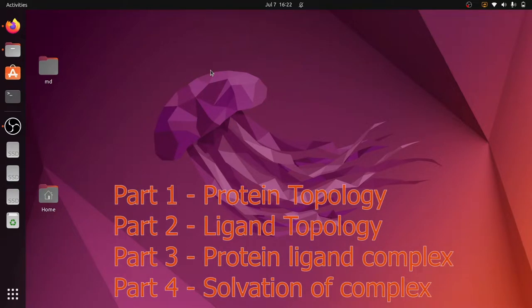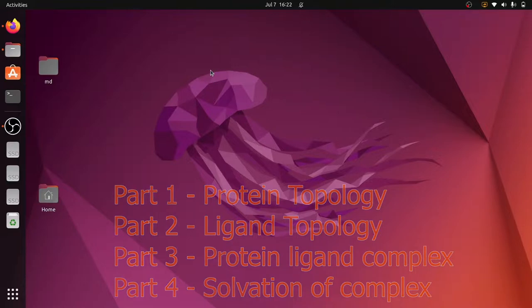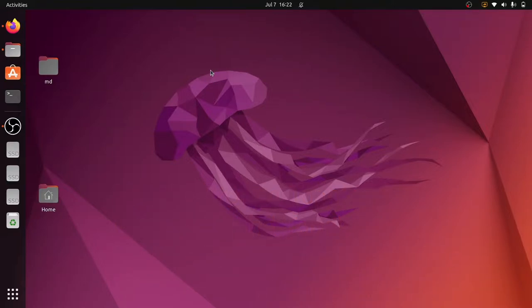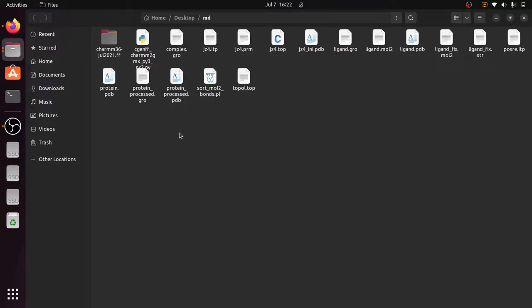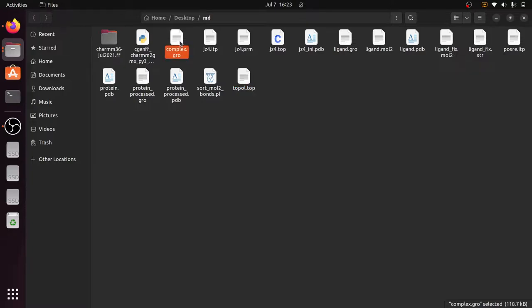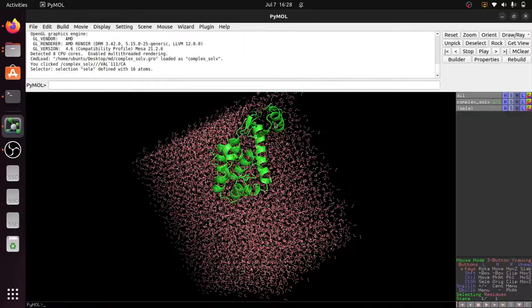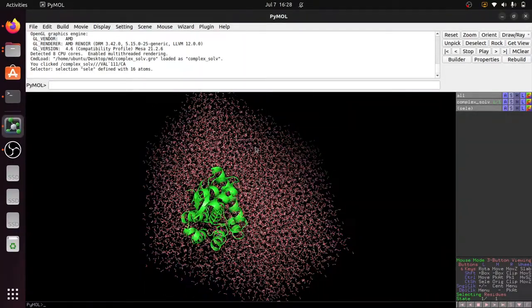Welcome everyone. This is the fourth part in the GROMACS tutorial series. We are going to define a unit cell and fill the unit cell with solvent molecules. In this folder you can find two files: complex.gro, which is the protein-ligand complex file, and topol.top, which is the topology file. In the previous video we saw how to combine the ligand .gro file and the protein processed .gro file into complex.gro, and how to create a protein-ligand topology file to generate topol.top. Today we are going to see how to define the unit cell and fill it with solvent.